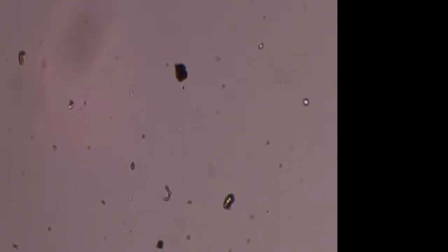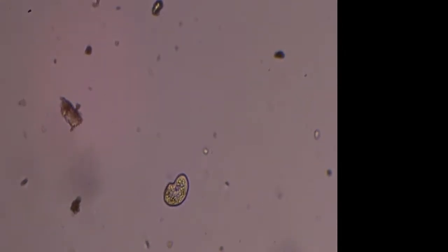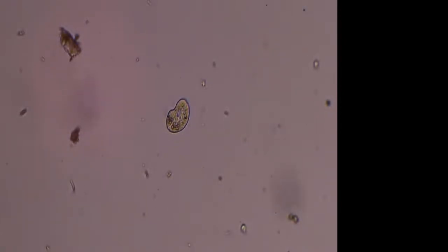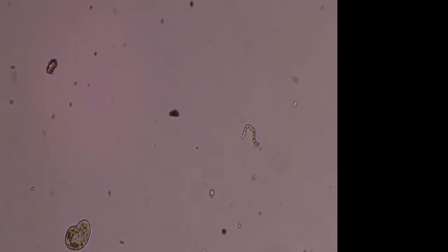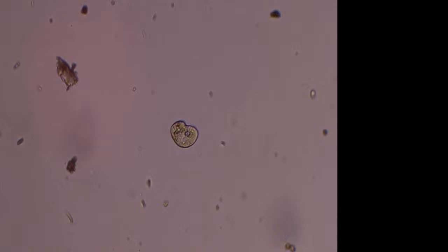Let's jump around a little bit more and see what we can see. There's some of those little guys swimming around. Little flagellates with their... Oh, what was that? Whoa, whoa, whoa. There we go. There's a nice ciliate. Like one of those typical kidney-like things I've been finding in the flower pots, so could be same stuff that's in the dirt down below, outside. Where'd it go? There it is. Yeah, it looks very similar to the ones that are in the flower pots from the previous streams.